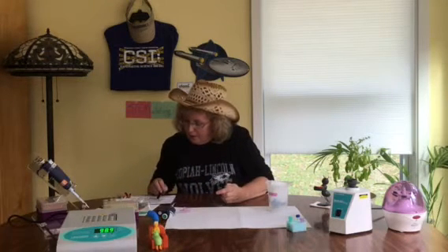Now we need to get ready for our new samples. So the other 5 tubes that you have, now would be a good time to label them. If you're looking at number 9, cell lysis, this temperature is 99 degrees Celsius, almost boiling. The heat is being used to rupture the cell membranes. So while cell lysis is taking place, you can go through and label all of your tubes.